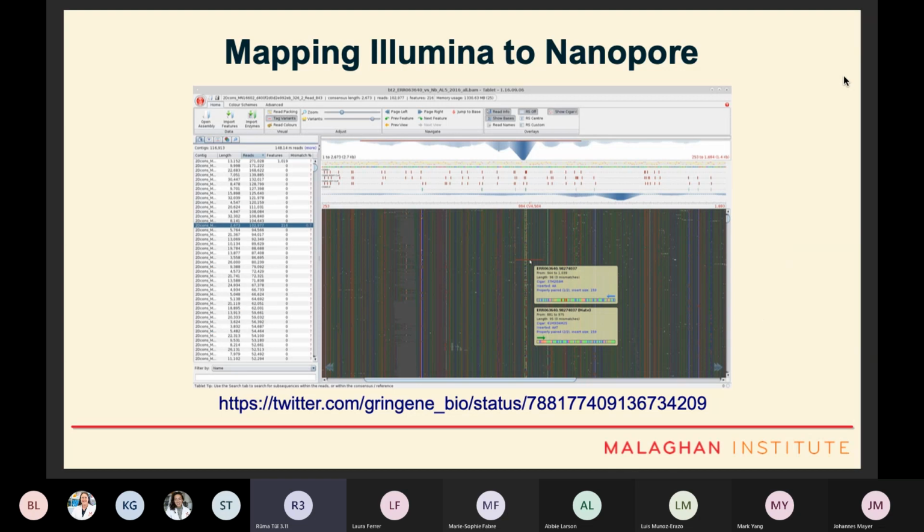I ran the DNA that they extracted on our nanopore MinION sequencer, and at that time got only a sprinkling of sequences that were fairly high quality, but not nearly enough for what I wanted to do, which was assemble a genome. But I was curious about what I could find with what I had. So the Sanger Institute in Great Britain had previously produced a genome sequence assembly for Nippo using an Illumina sequencer, using DNA sequences that were about 100 bases in length. So I had a go at seeing how many of those Illumina sequences I could find in the nanopore reads that I had generated on our MinION sequencer, our much longer nanopore reads.